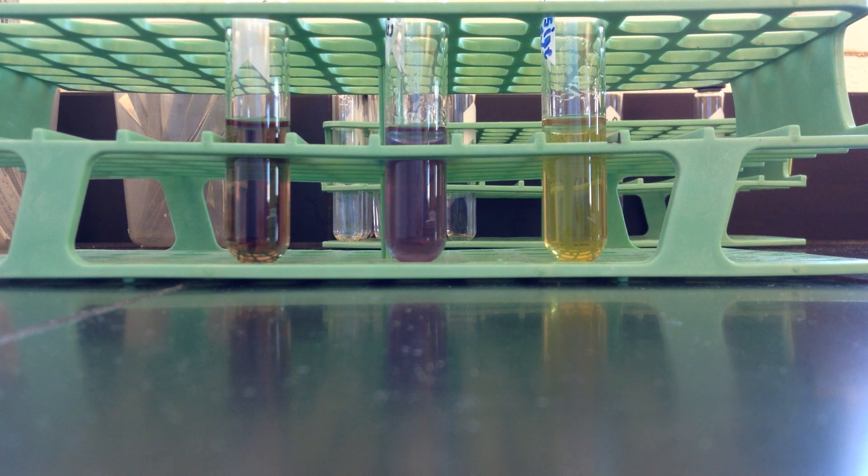So again, this is lysine decarboxylase broth, and we're looking to see if the organism has the enzyme lysine decarboxylase and can break down the amino acid lysine. That is the lysine decarboxylase broth.